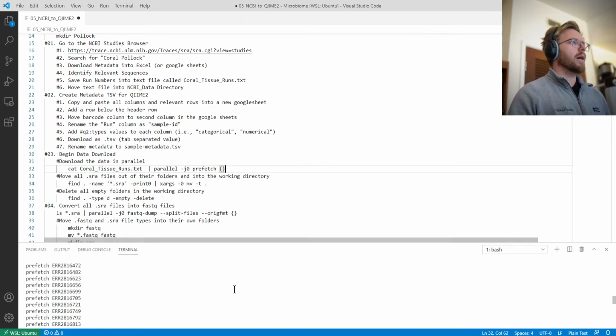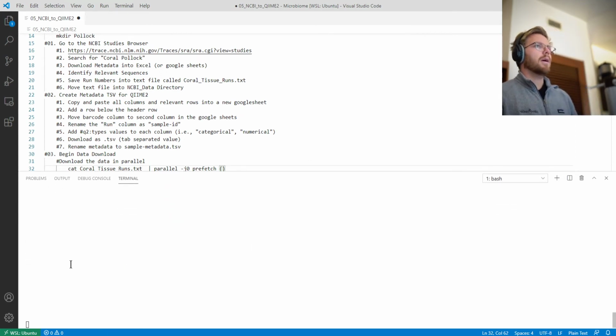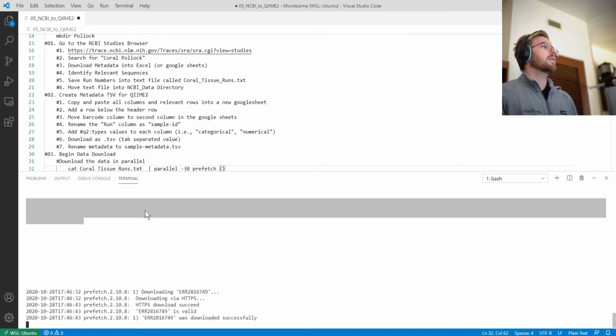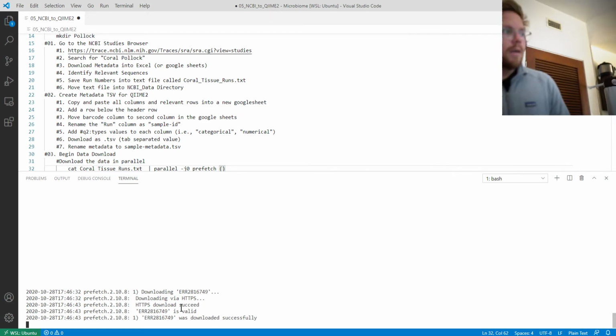And yeah, so let's just go ahead. So it is running the command right now. Ooh, and it's giving me lots of output that I cannot see because I think it's formatting it in a different color. Ah, no, here it is. That's great. So it's downloading the first file. I'm going to just switch real quick my internet connection. Make it a little bit faster maybe.